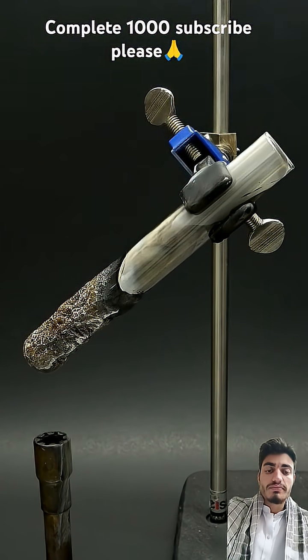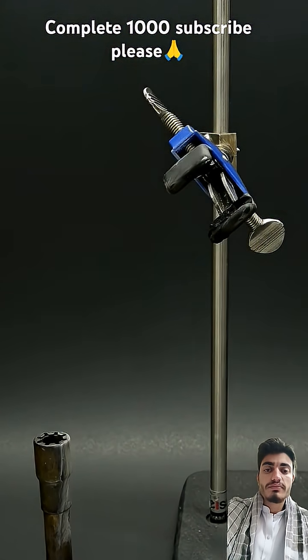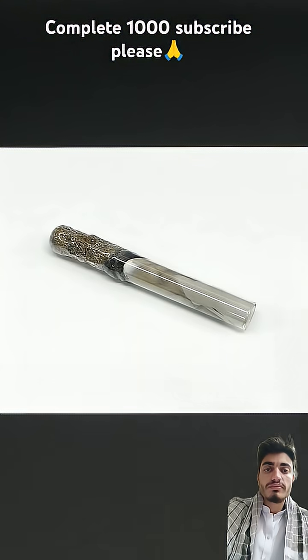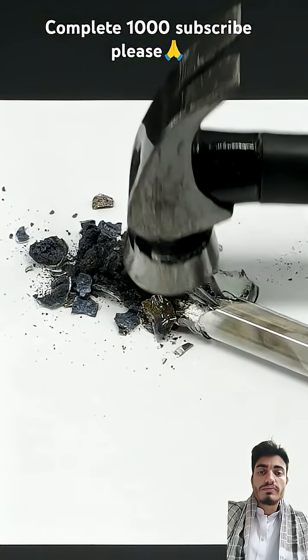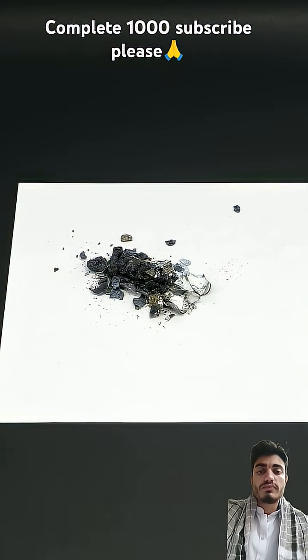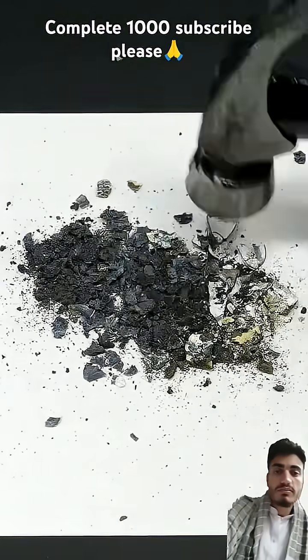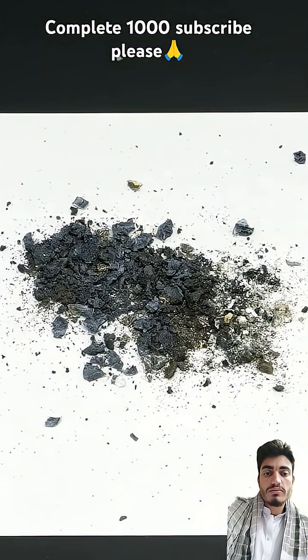At this point, the reaction is done, and what I have to do next is take the tube off the stand, carefully place it onto a piece of paper, and gently tap it to break it apart. I'll then just quickly get rid of the unbroken tube, crush it into a nice and fine powder, and get rid of as much broken glass as possible.